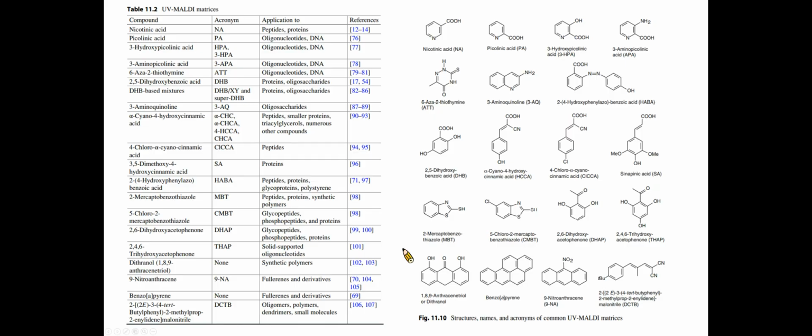The choice of matrix is one of the most important steps in MALDI analysis. The ideal matrix generally has the following properties: strong absorption at the laser wavelength used, better vacuum stability, lower vapor pressure, and good miscibility with the analyte in the solid state.